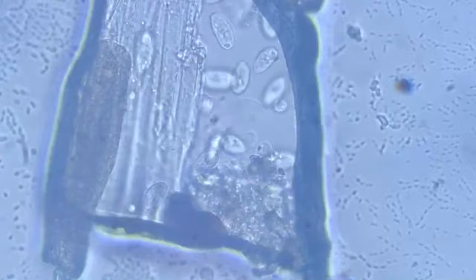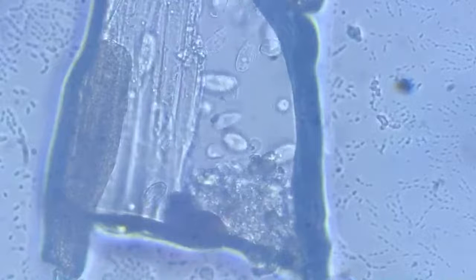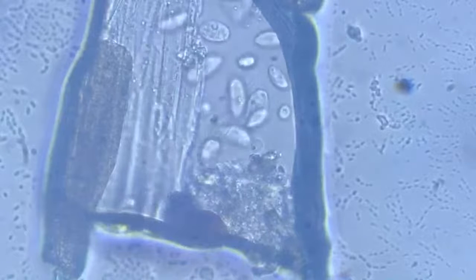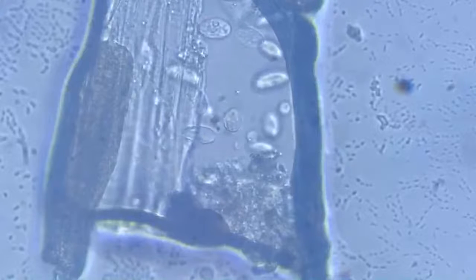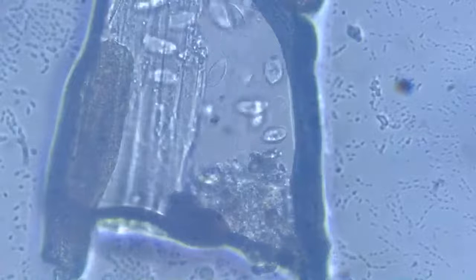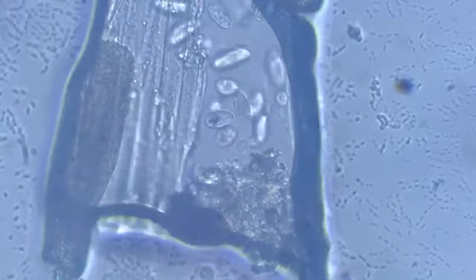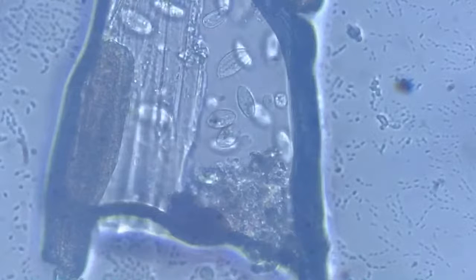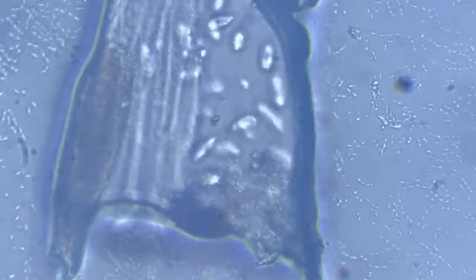It won't be too long before this water evaporates. There, the water layer has closed in a bit more. You can see that dark black band at the bottom. That is the interface of air and water.